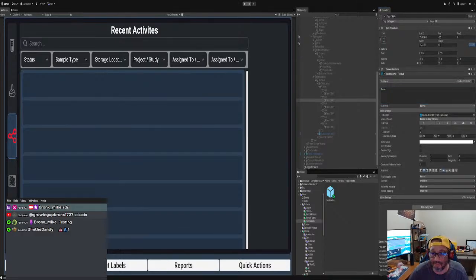And then we have unit, unit. Okay, so I put unit, and then we're gonna put in reference, right? Reference range, right? Now, in no way, in any way, okay, in no way is this comprehensive, all right? In any shape or form, all right?